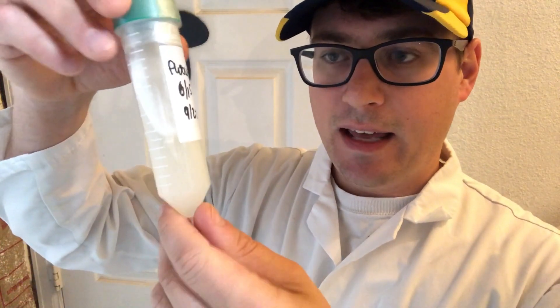A slant is much harder to observe; you have to stay on top of the growth in the early stages of inoculation to make sure there's no contamination present. That's the difference in the initial stages of growing your mycelium. Another really key factor for using slants is that they have what is called the butt — the lower portion that is a reservoir for nutrients.